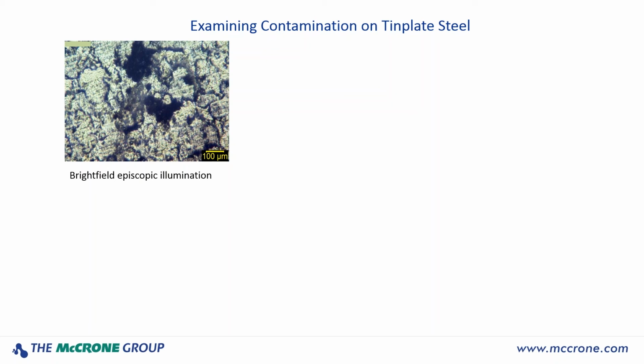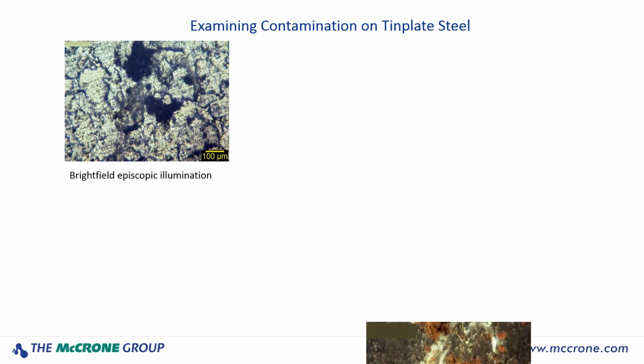You can also insert a polarizing filter into the light path, and that'll help reduce some of the glare, just like polarizing sunglasses reduce glare on ripples and waves from a lake. Under the episcopic illumination, we see in the center two large, very dark materials, and in between them at the center of the image is something a little lighter gray, and then the rest of the surface is just the tin coating material.